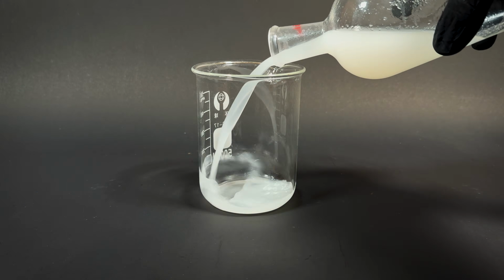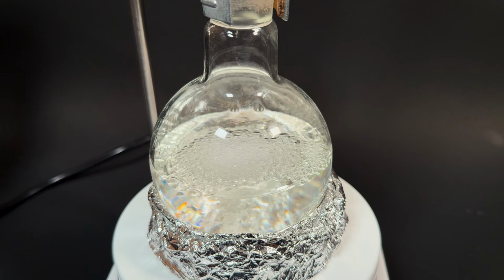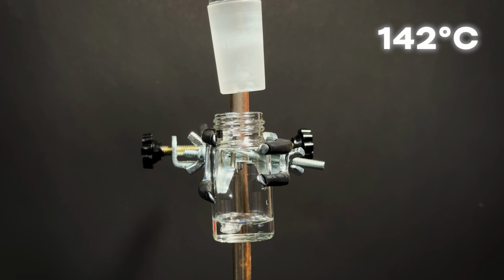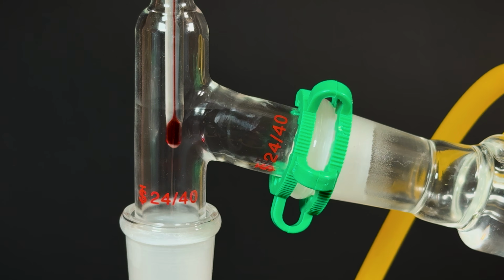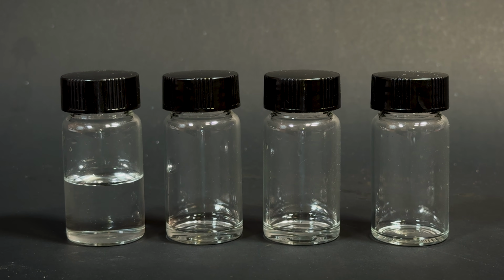After extracting, washing, and isolating the product, I set up the distillation, evaporated off dichloromethane, and collected fractions around 142 degrees. The problem was that I didn't have a proper thermometer. I was using the wrong one, and I couldn't accurately measure the temperature of the fractions. And I honestly didn't think I was getting isoamyl acetate, but I still collected 4 small vials.